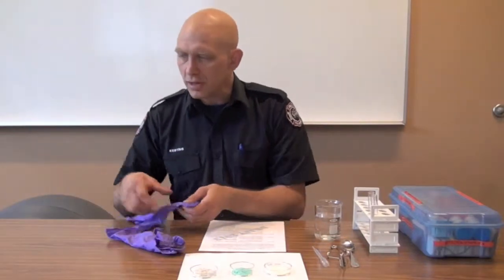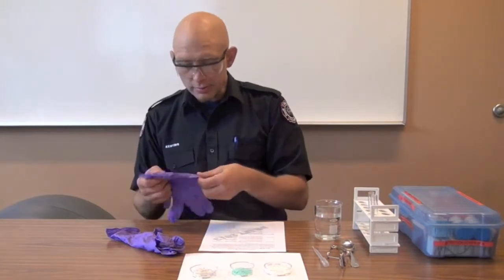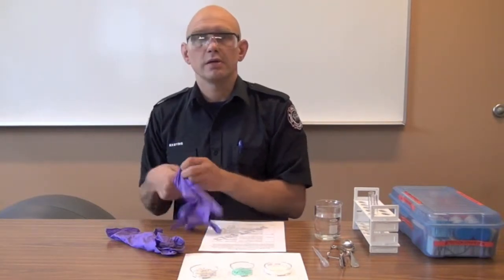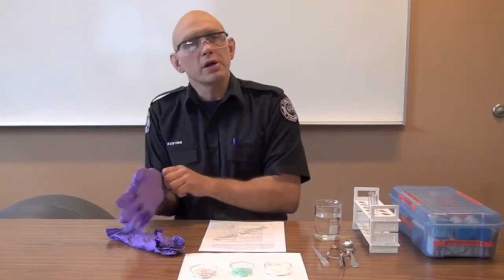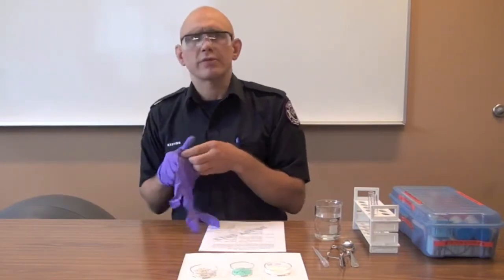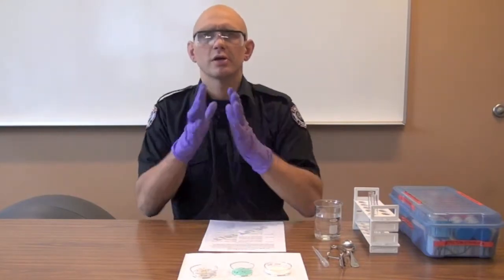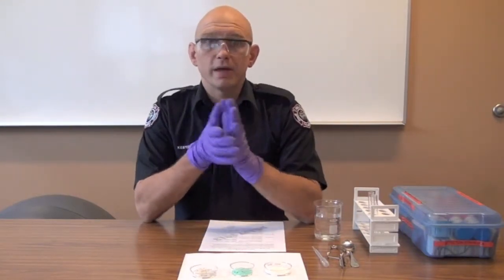A couple of safety notes: don't do this unless you've been properly trained in these tests and you're familiar with all the procedures. Secondly, you do have to wear PPE. I know what these compounds are, so I can get away with safety glasses and nitrile gloves. You may not be able to, because you don't know what it is. If it's a water-reactive compound, you could get shot in the eye with some chemical — that would be a bad day.